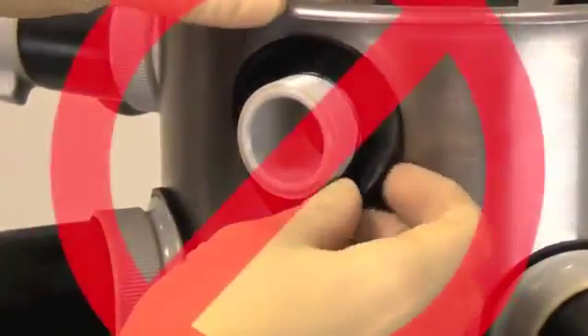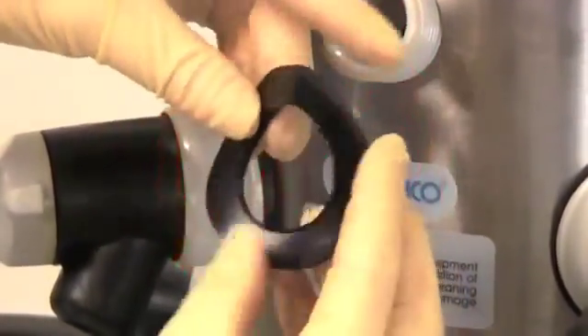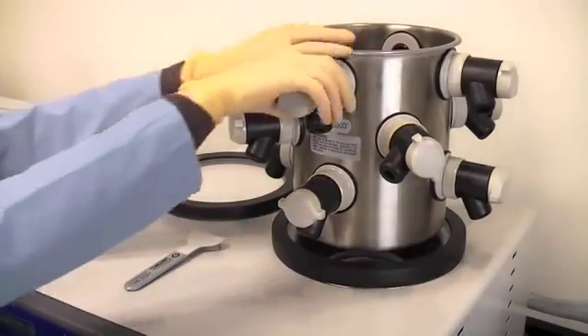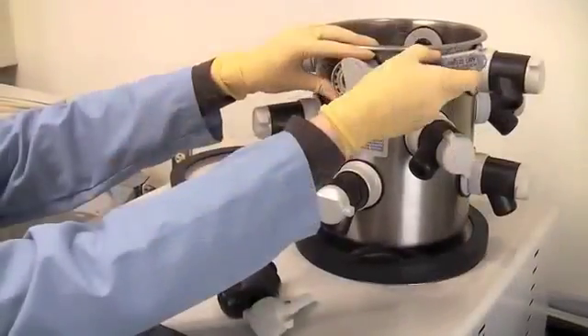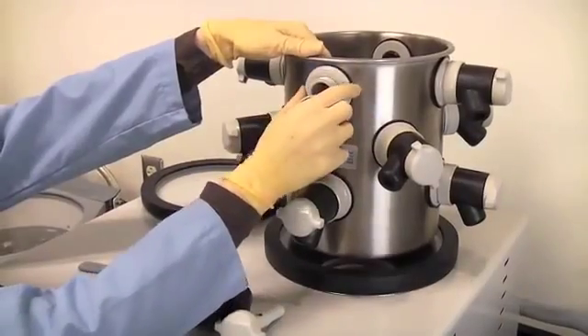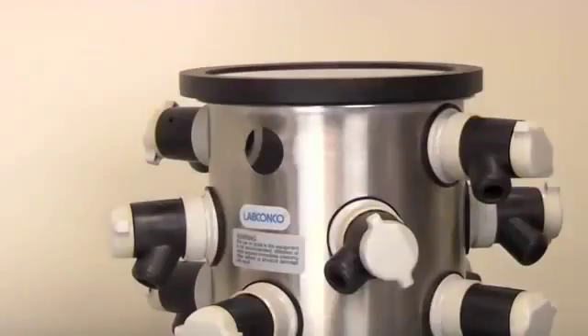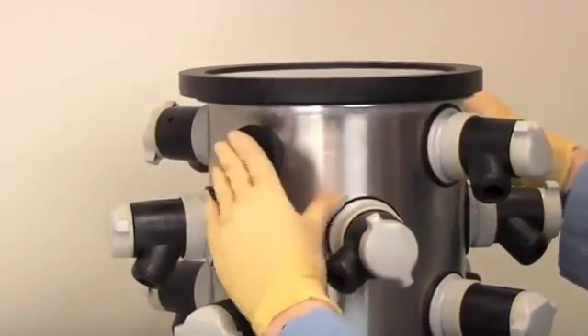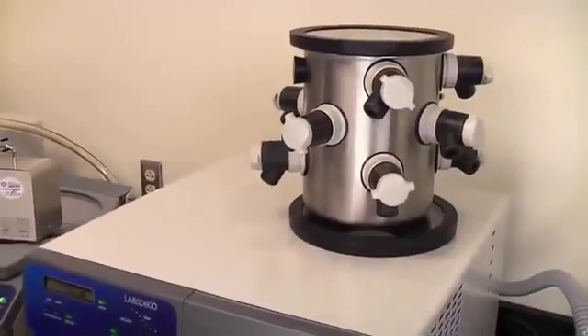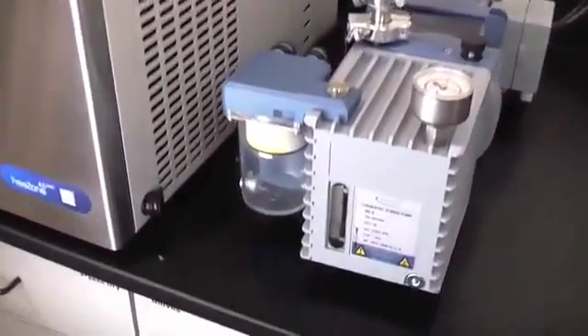Do not apply vacuum grease to the gaskets on a drying chamber sample valve. If a valve is the problem, remove the valve and stopper the hole with a rubber stopper. Continue this process for all of the valves.